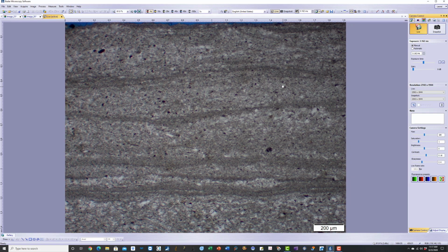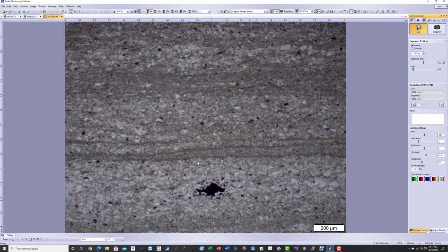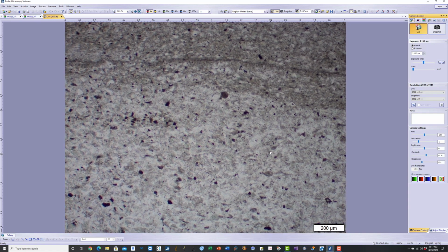In some areas you have fine-grained darker brown layers of carbonaceous and argillaceous materials in the slate, and some lighter areas where you have more of calcite, carbonate areas. These are calcite rich areas. These are carbonaceous, argillaceous areas. Some secondary calcite precipitate in the void spaces. So this is the scale, this is the slate paver.